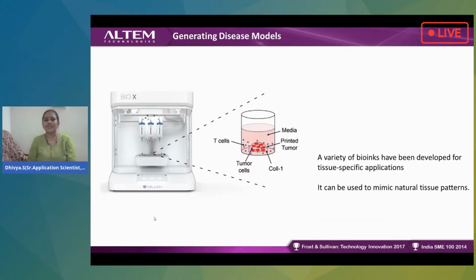So this is generating an example that I'm trying to show to you. A single tissue, or even larger tissues that you want to see. Say this BioX, the bioprinter, has the feasibility to print your cells even in culture plates, even in 96 well plates, or whatever well plates are being described in a BioX. That can be done. So you can have even a bulk tissue or larger cultured tissues.